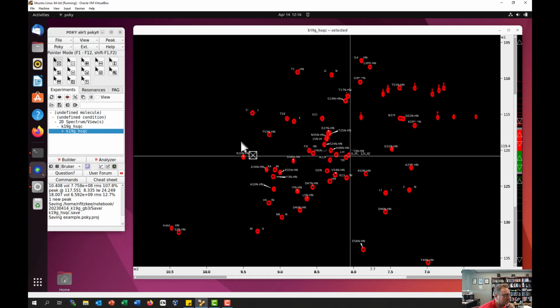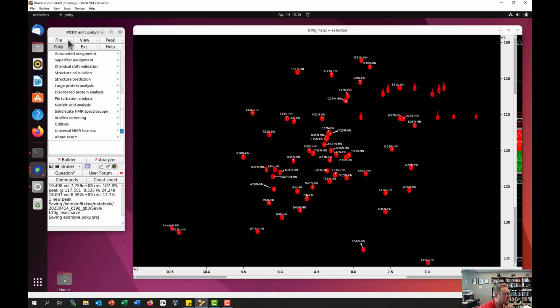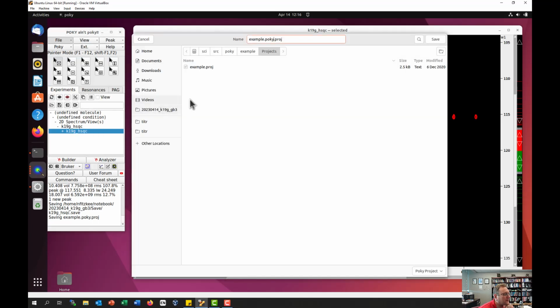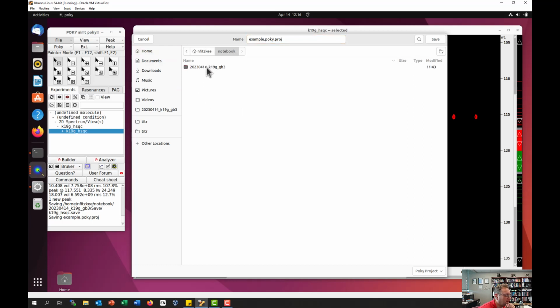this is a configuration issue that I have to deal with. But let's make sure that I hit File, Save As. So I have to go in and put the directory in. On your computers upstairs, you shouldn't have to do this. And if it continues to be a problem, we can talk to Woonghee and see if he can fix it.